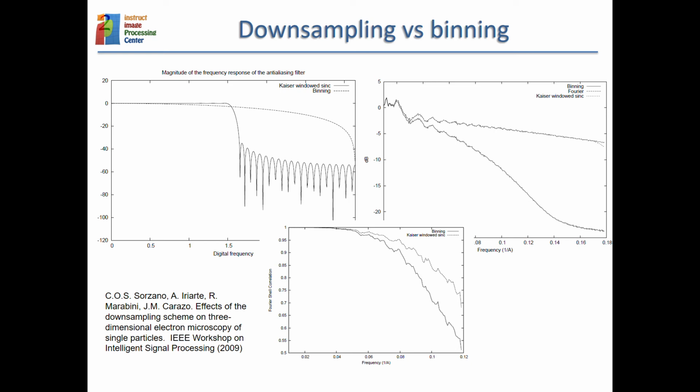So you want to use smaller micrographs for several reasons. They occupy less space, they make your algorithms run faster, and there is a much more fundamental reason: if you make them smaller, you're removing noise, and this noise removal will help the algorithms to align the images. And there are different ways of doing the downsizing.